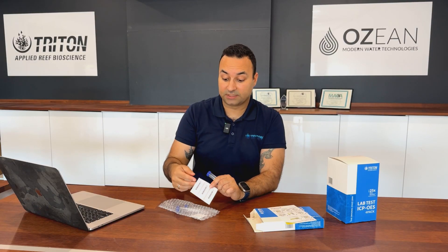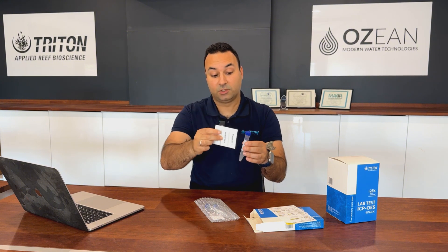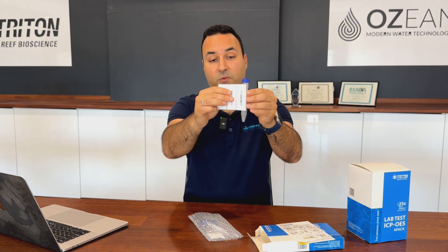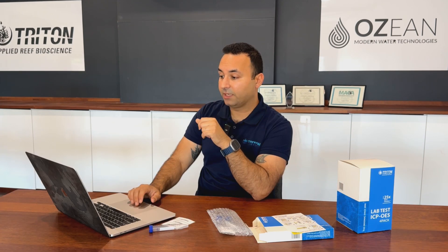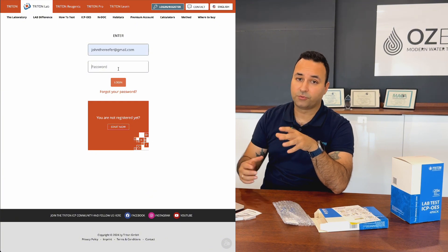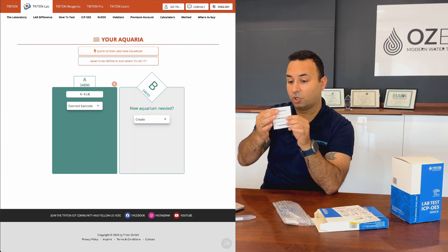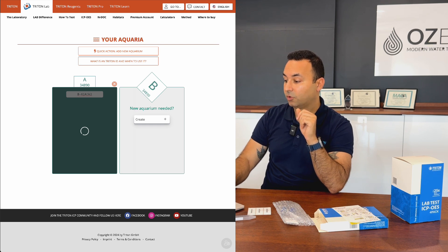The next important step is applying the barcode stickers. All three vials share the same barcode, so you apply one to each vial in the correct orientation — align it with the white square on the container. Then log in to your account, go to the 'Connect Barcode' button, enter the code shown above the barcode making sure all capitals are correct, and press connect.